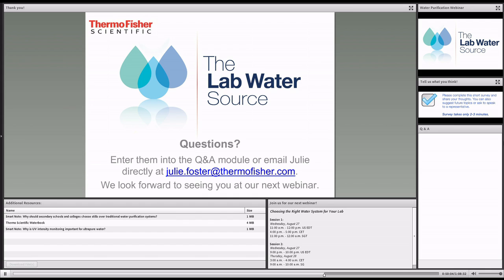And it's completely based on how much you're using in your lab. There are some features that have come out. Certainly from Thermo Scientific, we have some smart water tanks where, even if you had a 100-liter tank, you can tell the water system, I need you to only be a 30-liter tank today because we're not going to use much water for the next few weeks. So we're becoming more savvy with how to help customers control bacteria in the tank.